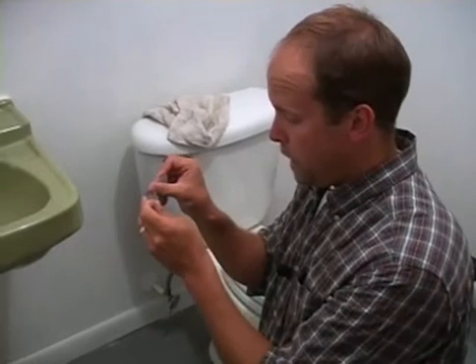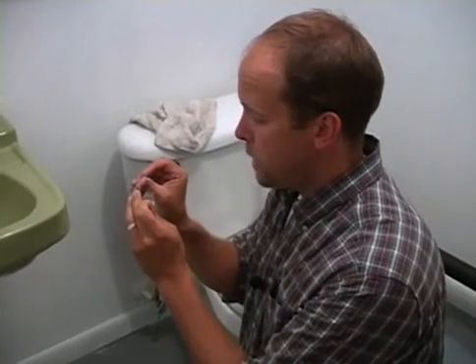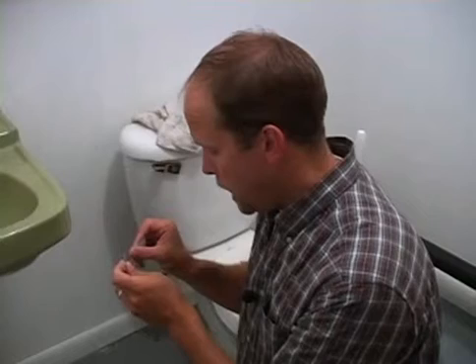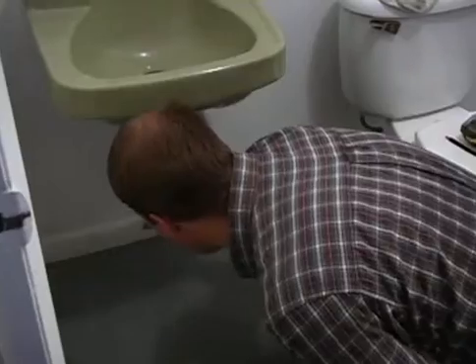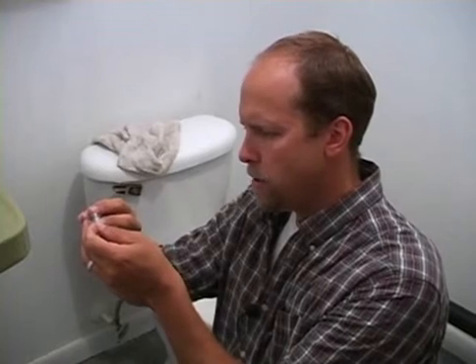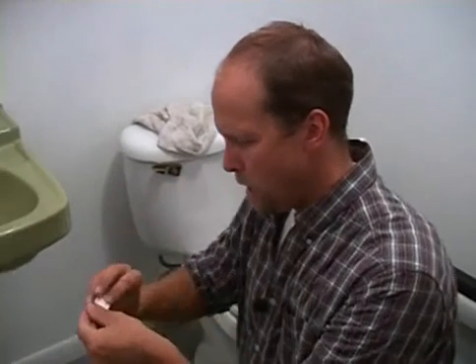I'm going to bend that piece of plastic, not too much, because if you warp it, the laboratory can't read the tape. And I'm going to just do a gentle surface sampling, and it only takes a moment. Surface samples are great. It's an affordable way to take a lot of sampling. Perfect. I'm going to put this in.